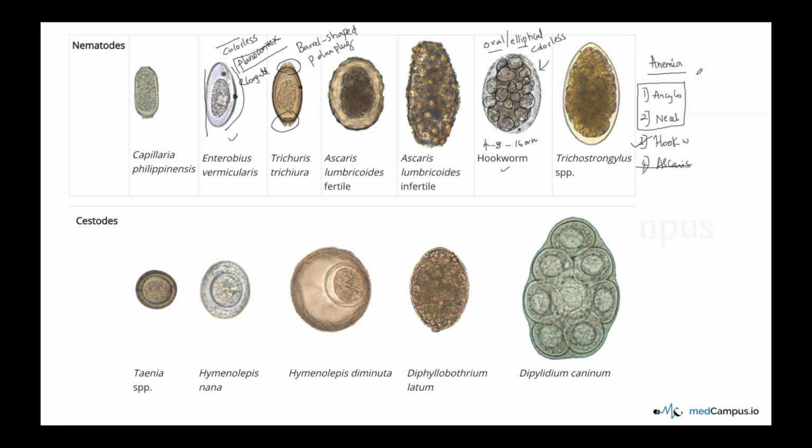So these are the three important eggs which are frequently asked in the exam. You might be worried about how to go ahead and finish up these eggs, but I have seen only questions from these three. Very rarely have they gone into cestodes and also trematodes. But mainly Enterobius, Trichuris and also hookworm questions are asked.